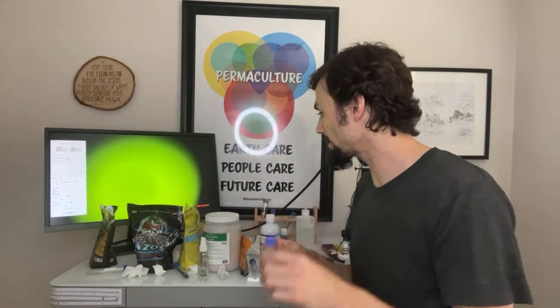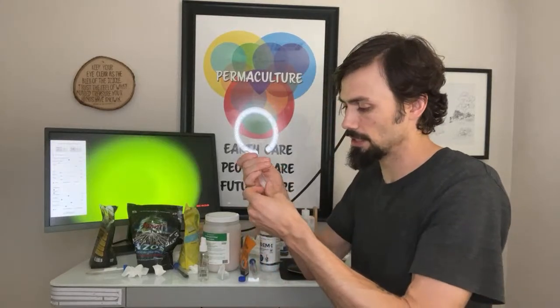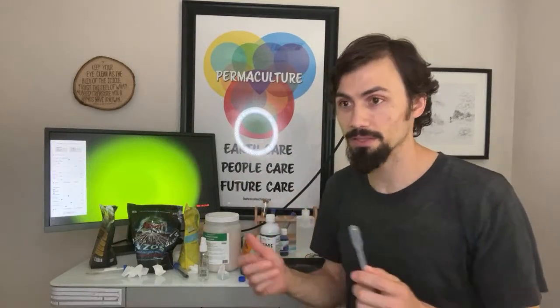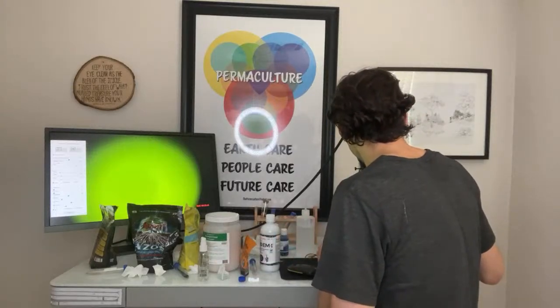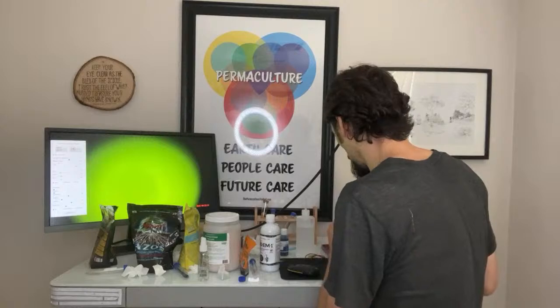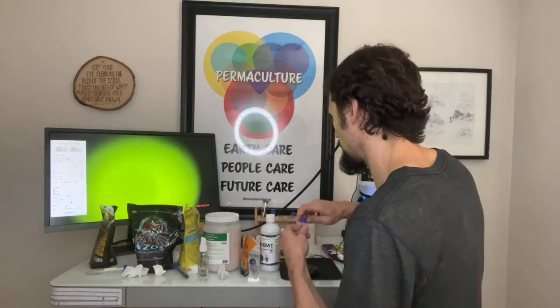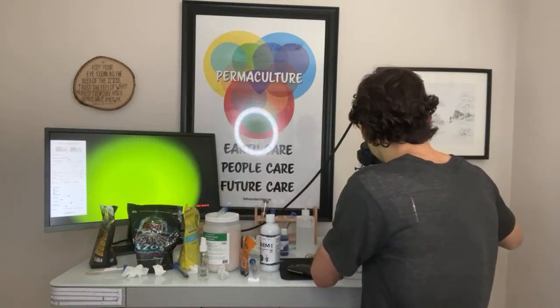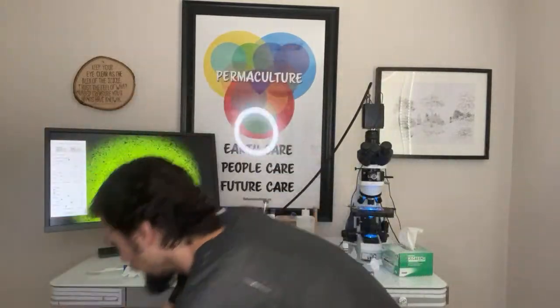We did this. Let's do, for comparison, a pure endomycorrhizal inoculant, and let's see if it's spores, or roots, or hyphae, because those are the three things it could be. One drop, not a lot. Here we go. And I'm gonna move it out of the way.